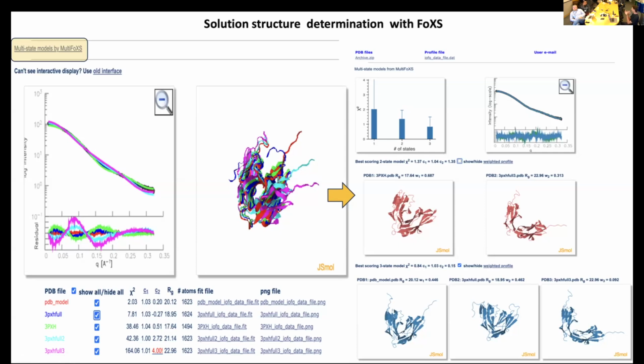a slightly different tilt, a little bit, not too much, was required to match the data. Instead of 2, we got the chi-square 0.84. That's for the 3-state model that fit the data the best.